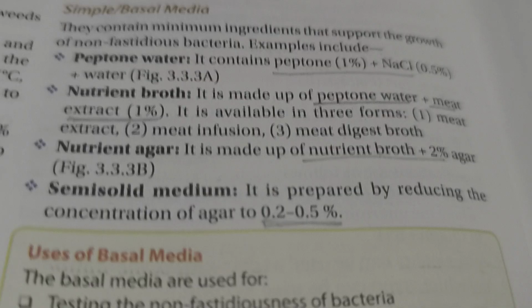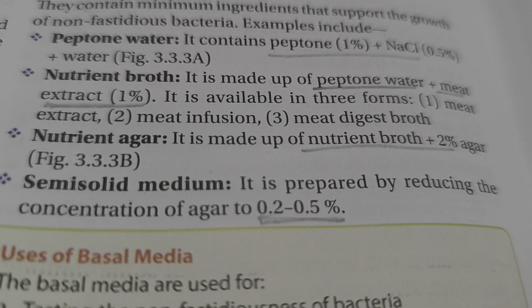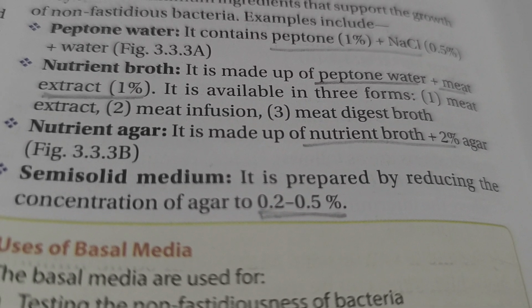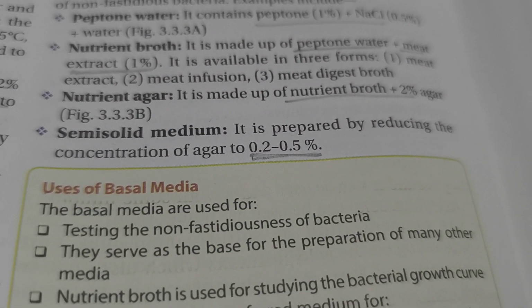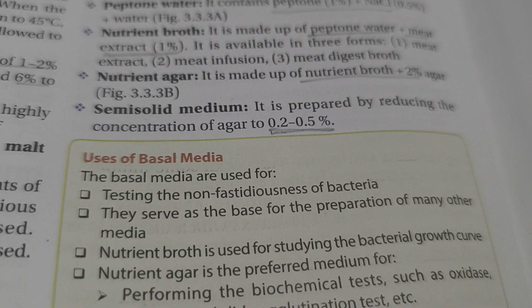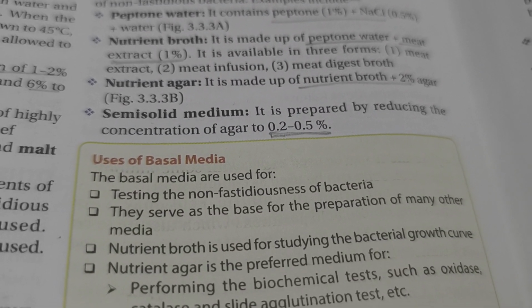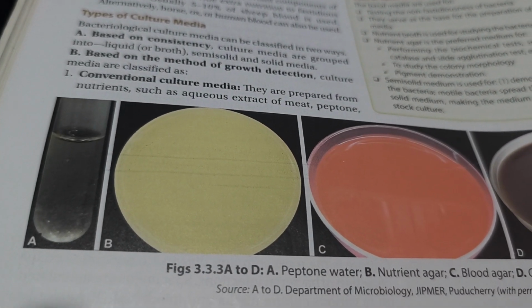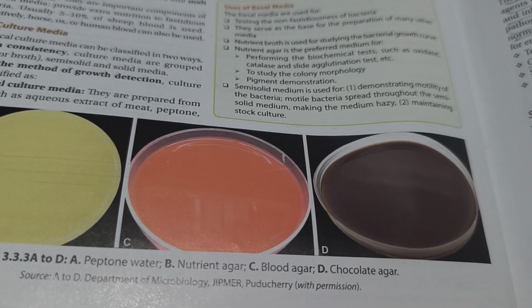Nutrient broth. It is made up of peptone water plus meat extract 1% and is available in three forms: meat extract, meat infusion and meat digest broth. Nutrient agar. It is made up of nutrient broth plus 2% of agar. Semi-solid medium is prepared by reducing the concentration of agar to 0.2-0.5%. A is the figure of peptone water, B of nutrient agar, C of blood agar and D of chocolate agar.